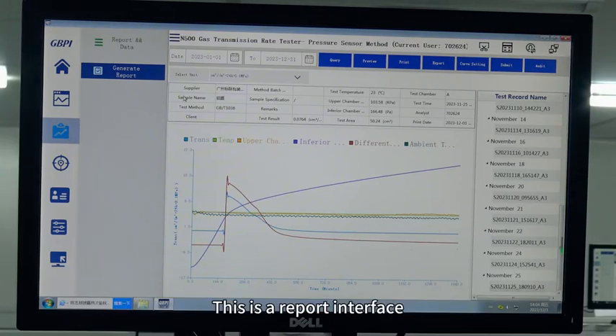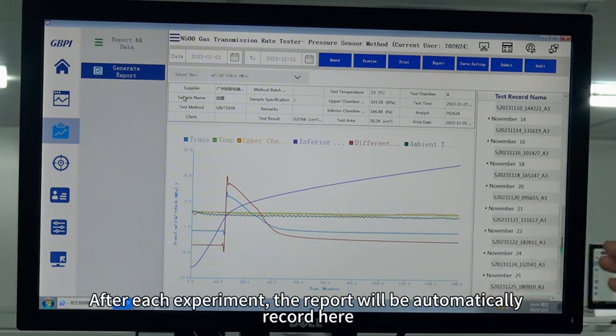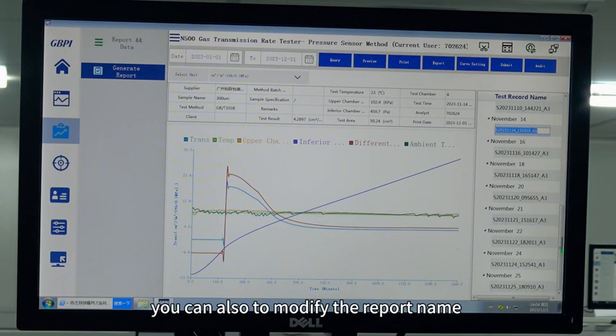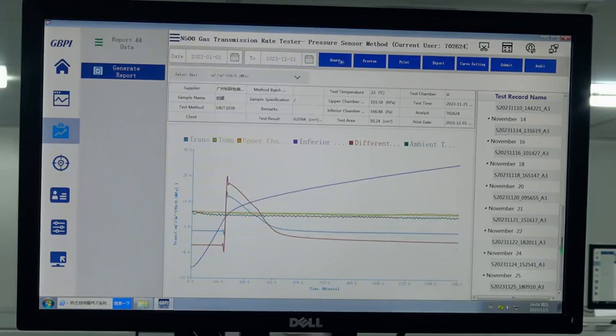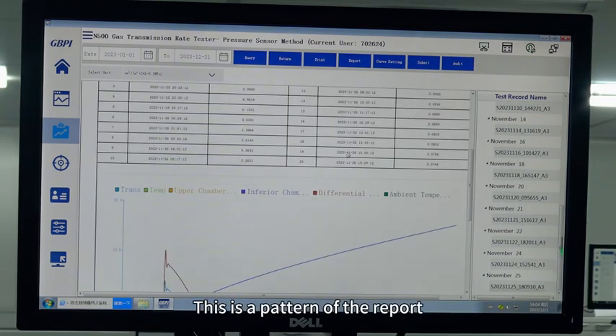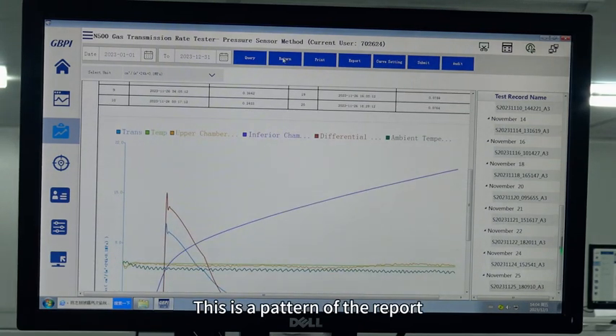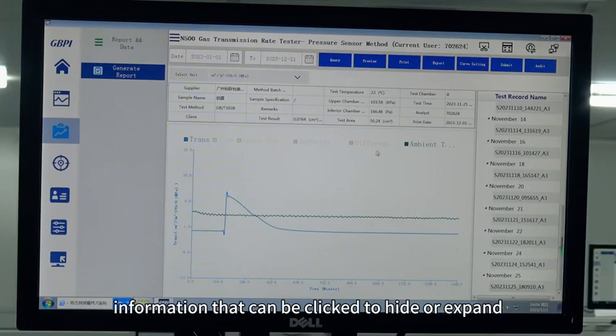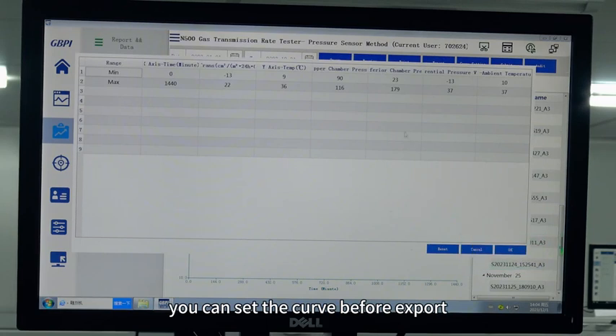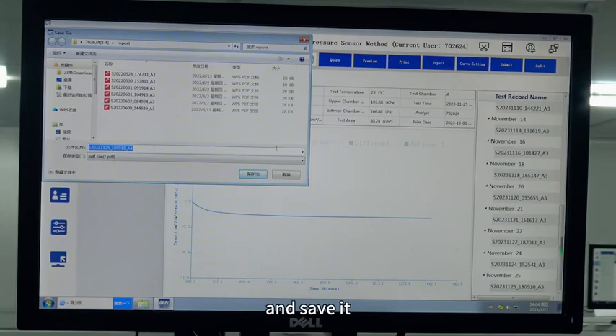This is the report interface. After each experiment, the report will be automatically recorded here. You can also modify the report name and query based on date. This is the format of the report — information can be clicked to hide or expand. You can set the curve before export, then export and save it.